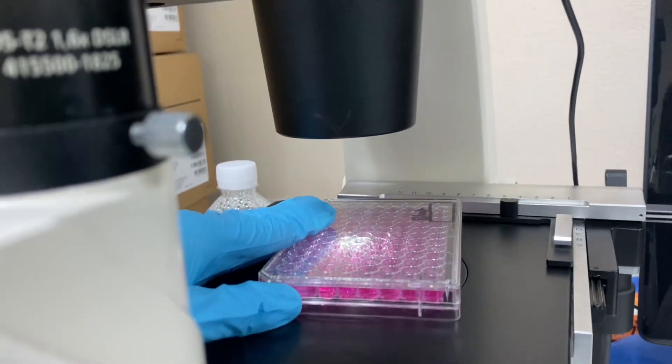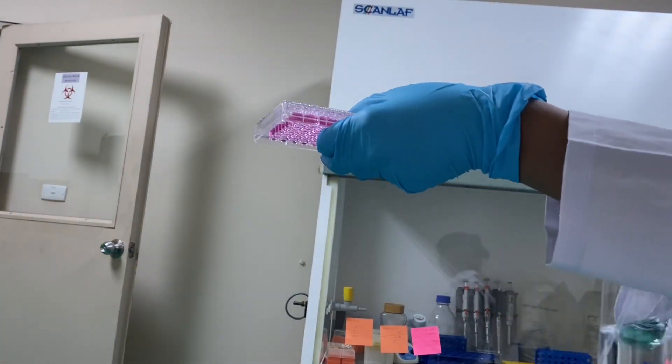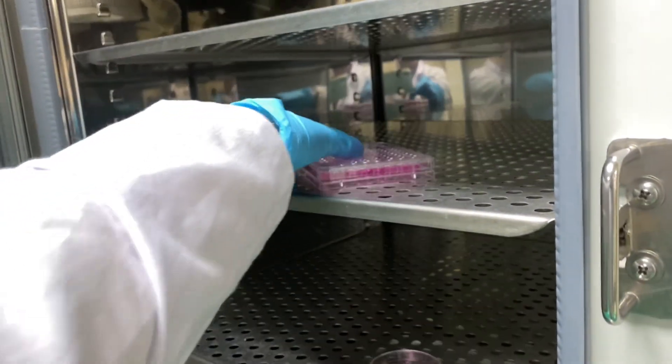It's time to take a look under the microscope, then spray alcohol all over the plate to prevent contamination, and then put it in the incubator. That's it!